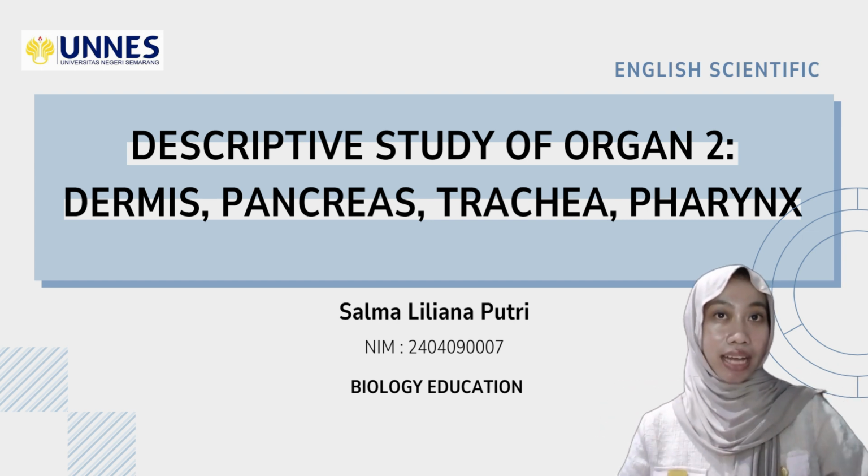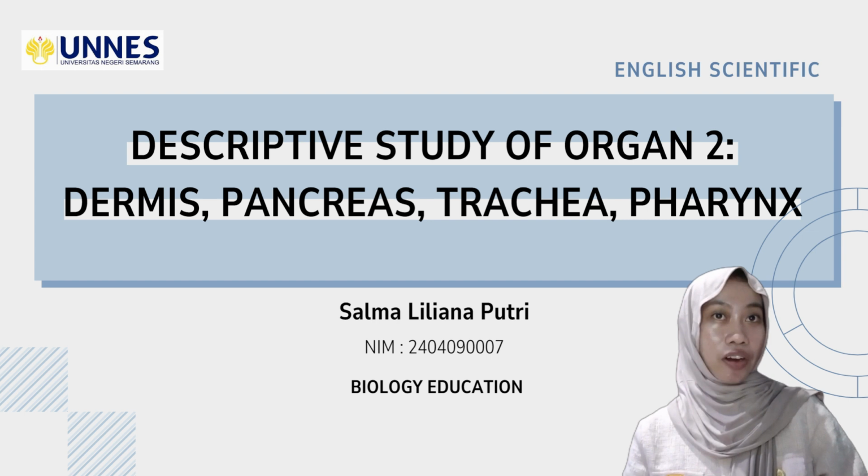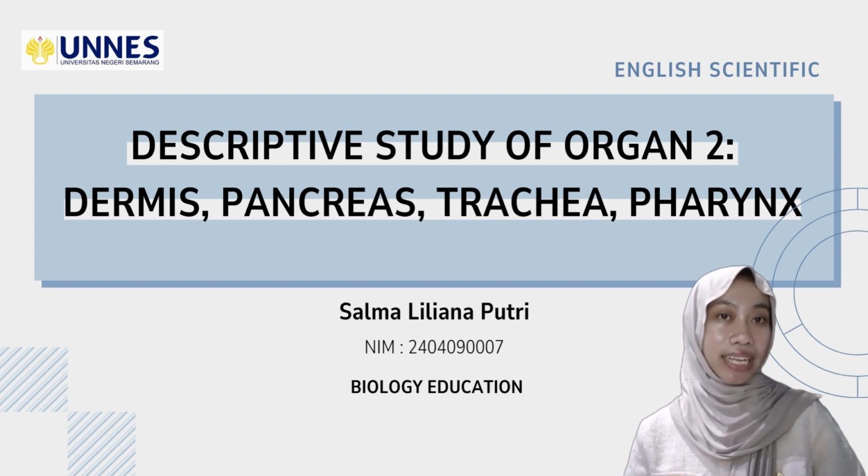Here I will discuss the descriptive study of organ 2, namely the dermis or skin, pancreas, trachea, and pharynx in the practicum of the animal tissue structure course.